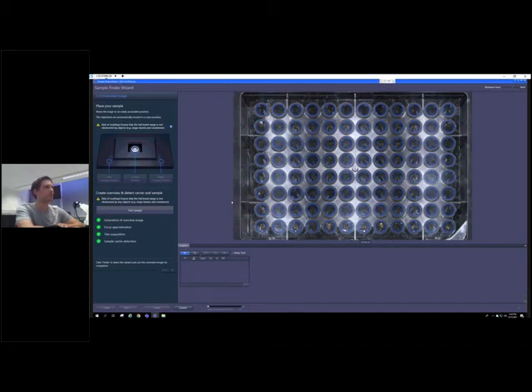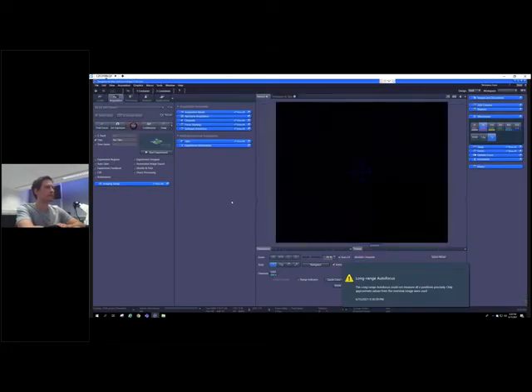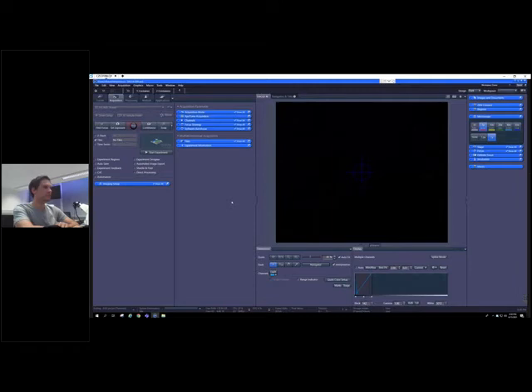And as you will see in a minute, the experiments that we are assigning now are all being assigned in the so-called carrier-based mode, meaning that the carrier information coming from the AI sample finder will be used for the calibration of the microscope stage, and will also be used directly to assign the correct well ID to our experiment data.